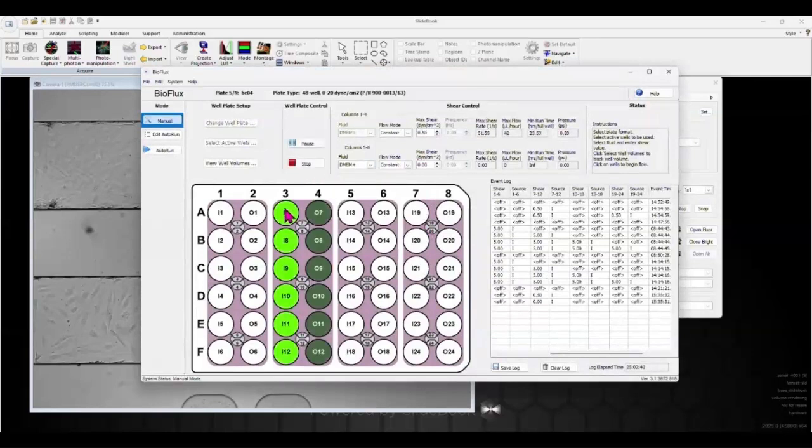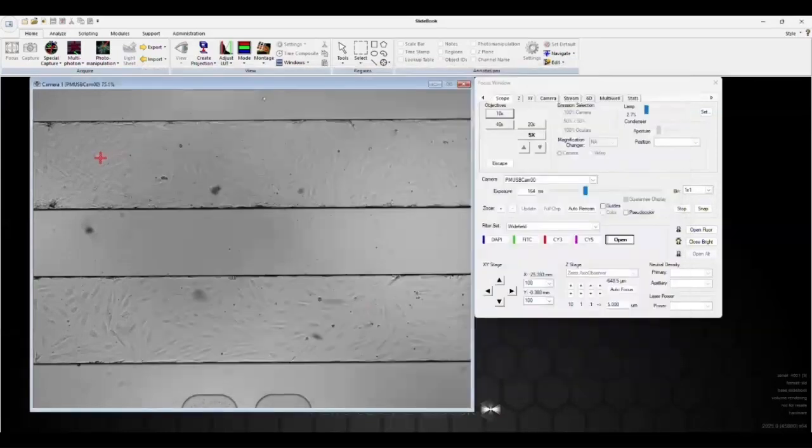We should soon see the Jurkat cells flowing through the microfluidic channels. We'll give them a few seconds to reach the viewing window. Because we're testing adhesion to two conditions, unactivated and activated HUVECs, we expect to see more adhesion of Jurkat cells to the bottom microfluidic channel than the top. As you have also probably noticed, we're starting our imaging in bright field, but we'll switch to fluorescence shortly, since we stained the Jurkat cells with NucBlue so you can more easily visualize where they adhere and how they flow.